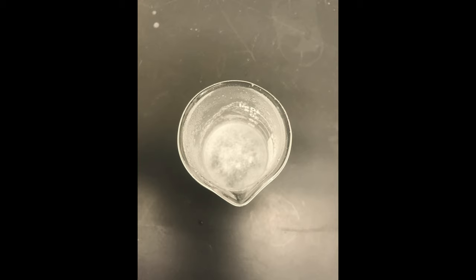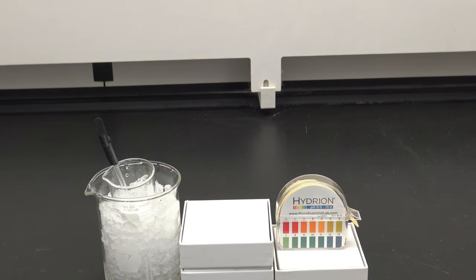So as I was adding acid, every time I added acid, I could see a little bit more white precipitate form. And finally, once we got down to pH around 2, I could see a lot of solid white material appear. I'm now going to take my beaker over to the vacuum filtration apparatus and separate out the solid salicylic acid from the liquid.